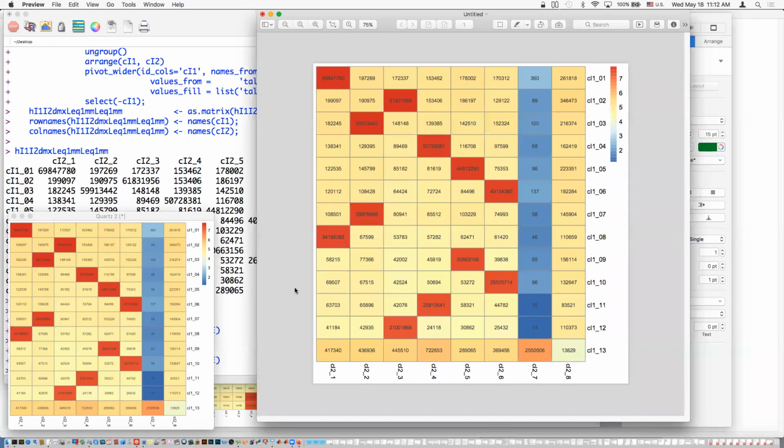If you did it as a single-ended run, the demux pile output for I12, or for number 12, would be this guy plus this guy plus this guy plus this guy plus this guy plus this guy plus this guy. And all these guys, which are basically things with the wrong pairing of tags on, would all go here, but you wouldn't know. And so they would essentially create contamination in the plot. So it's really the dual that lets you see that this is obviously happening.